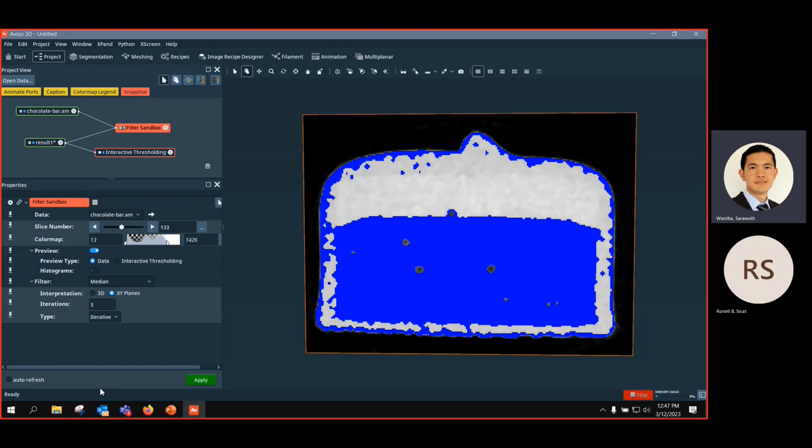Everybody is processing the image. You can see that the variety of the images always has certain different ranges. So in which case do I want to do histogram normalization, for example?